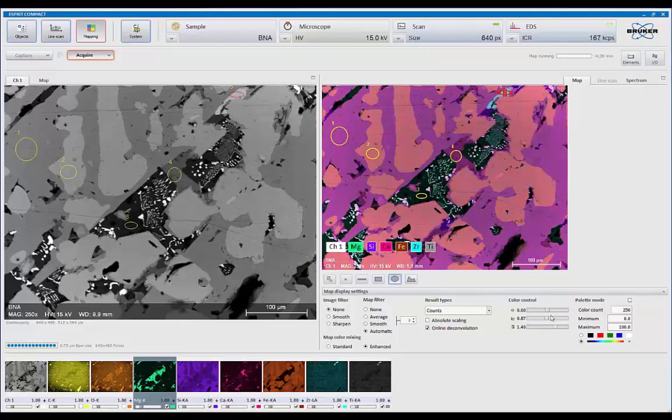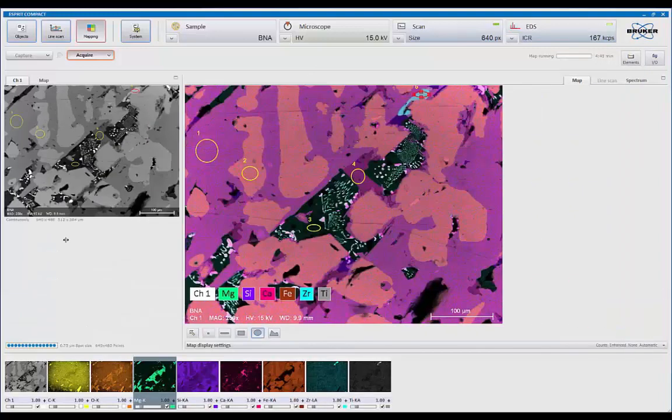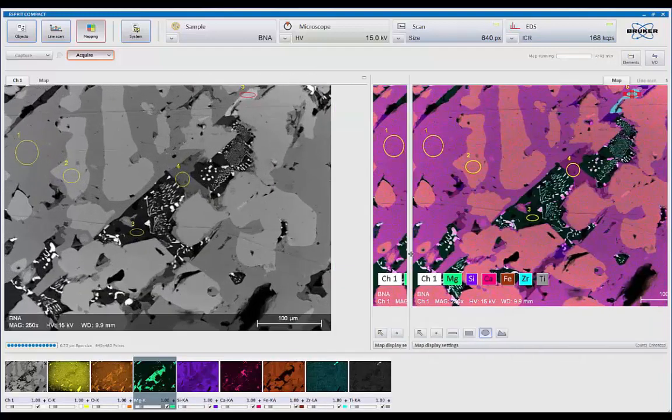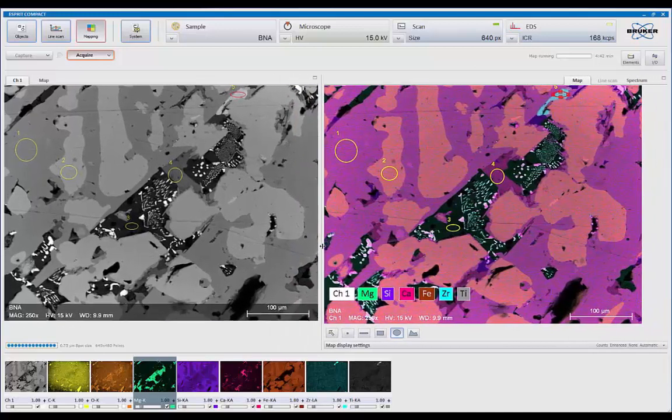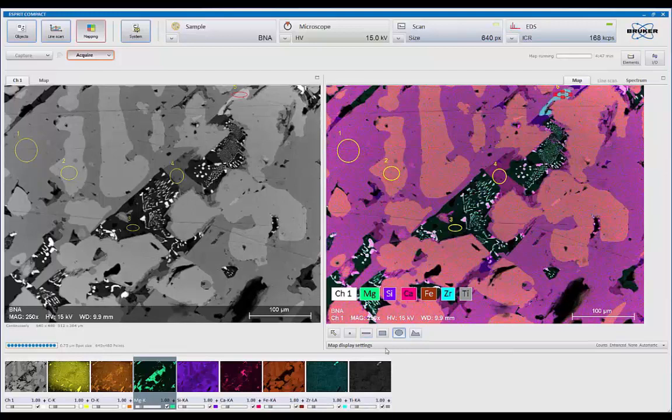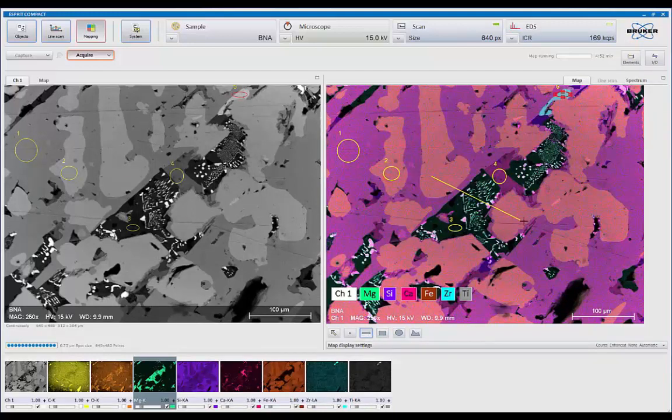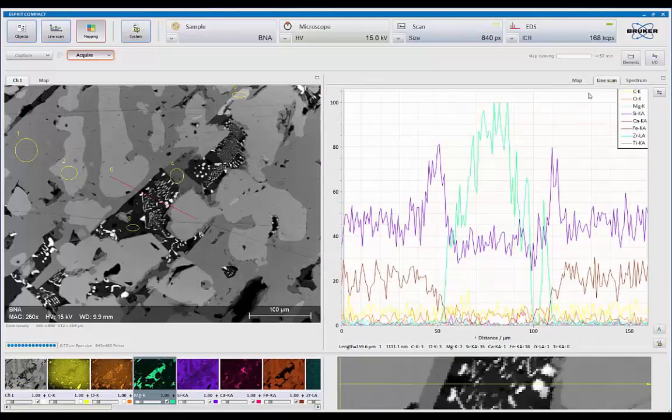And again, I can change the relationship between these two maps. So I can make them one bigger or smaller. And we're doing this all while we're still collecting. The other thing we can do is we could look at a line profile. So I could come in here and say I want to select a line profile across that vector there. Hit line scan.